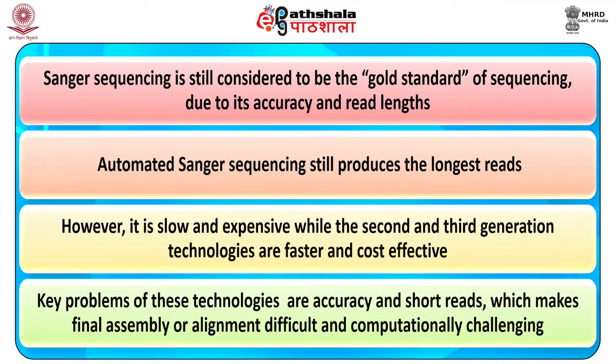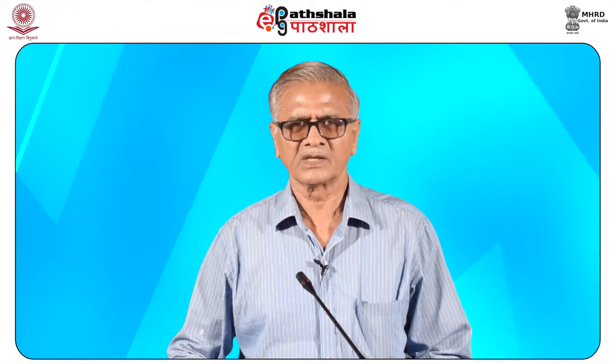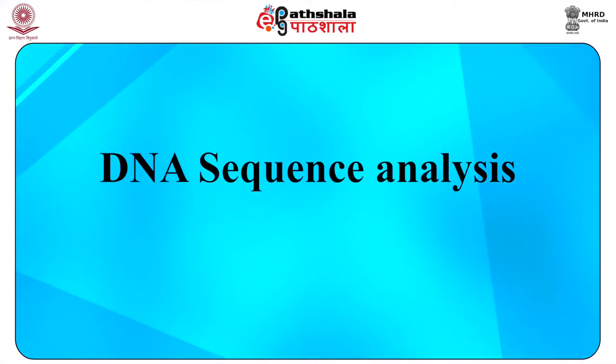In conclusion, it can be said that Sanger sequencing is still considered to be the gold standard of sequencing due to its accuracy and read lengths. Automated Sanger sequencing still produces the longest reads. However, it is a slow and expensive technique, while the second and third generation technologies are faster and cost effective. The key problems of these technologies are accuracy and short reads, which make final assembly or alignment difficult and computationally challenging. Therefore, the choice of the technology depends on the required application and the advantages and disadvantages of the particular sequencing approach. Now, after doing sequencing, how can we analyze the sequencing data?